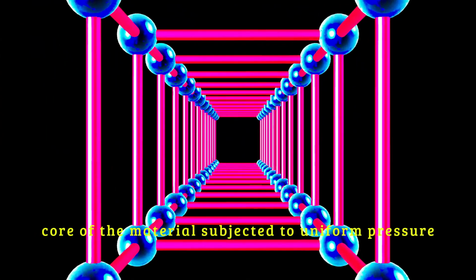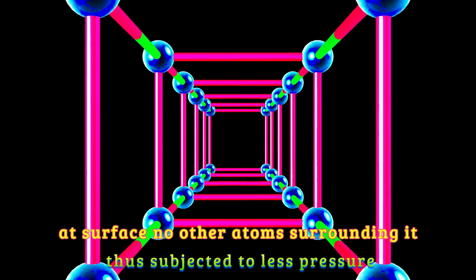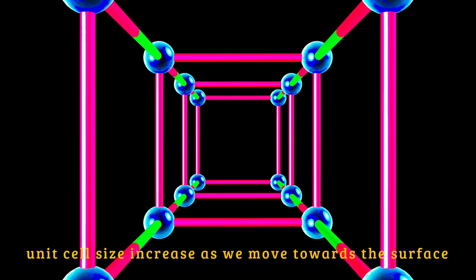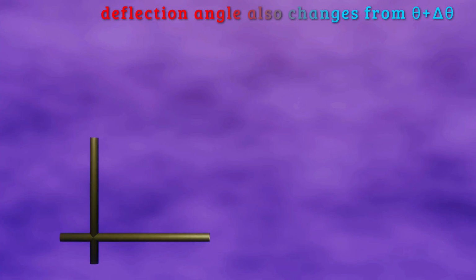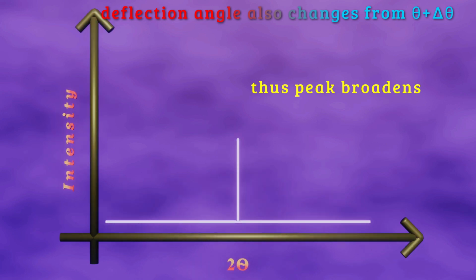During the formation of crystals, the atoms inside the core of the material are subjected to uniform pressure, thus having the same unit cell size. As we reach the surface, there are no other atoms surrounding, thus it is subjected to less pressure. As a result, the unit cell size increases as we move towards the surface and becomes a plus delta a. The angle at which the X-ray deflects also changes to theta plus delta theta, which manifests as peak broadening in the X-ray diffraction pattern.